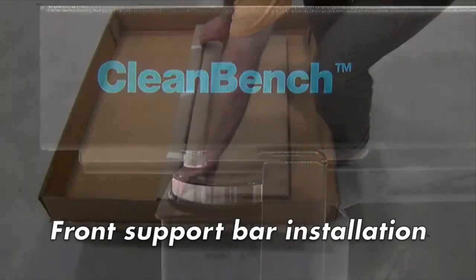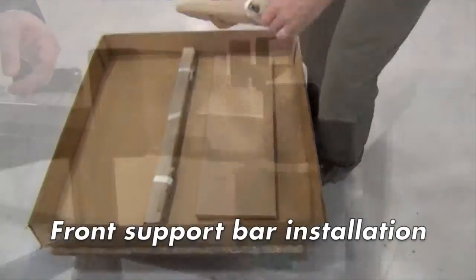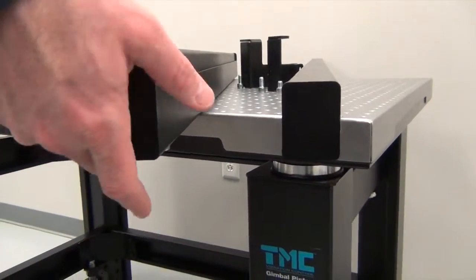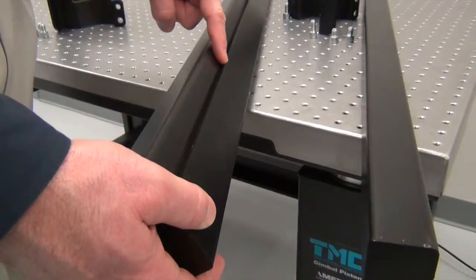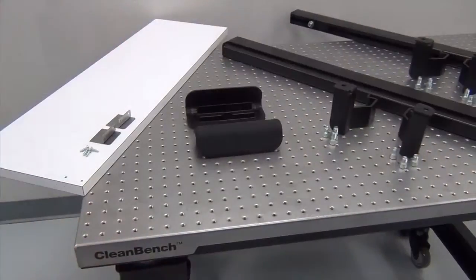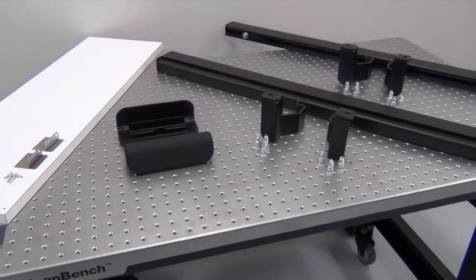Start with the front support bar. It has a tall cross section and a slot along the back edge. Locate the support bar brackets and fasteners.